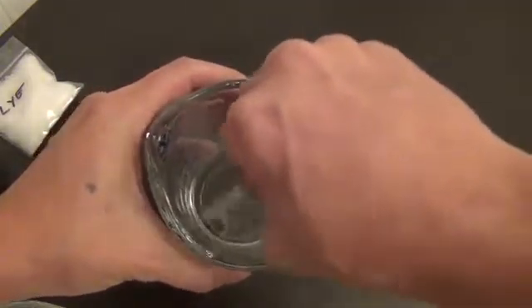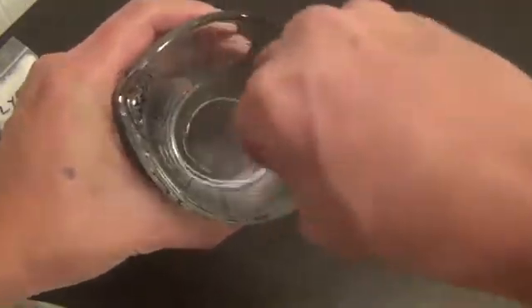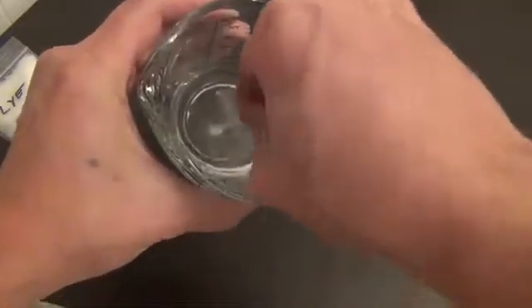Mix it up until it dissolves. This will take a minute. I put a spoon in and grind it against the side of the glass container.